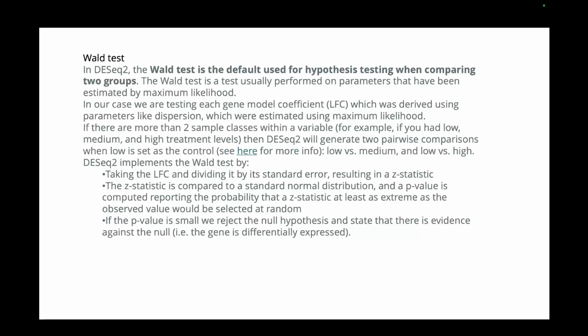So what you are saying is, your null hypothesis is that you do not have any differential expression. But what you see is that the maximum of the data that you are seeing in the standard normal distribution is having log fold change.